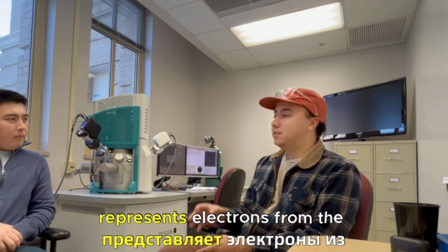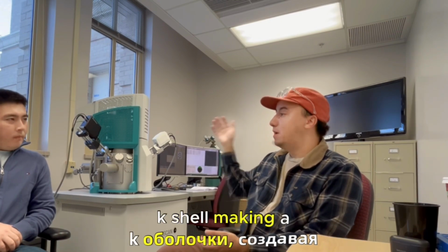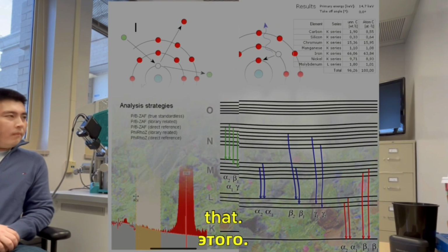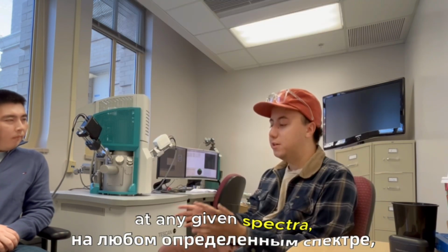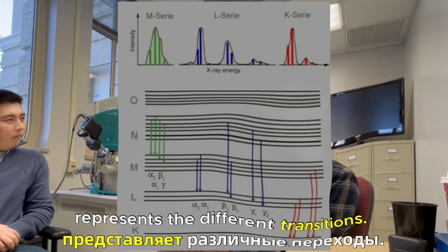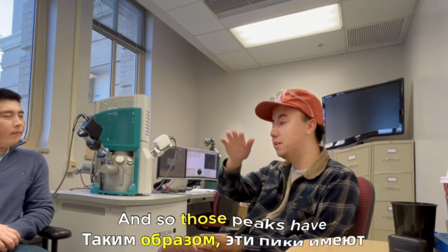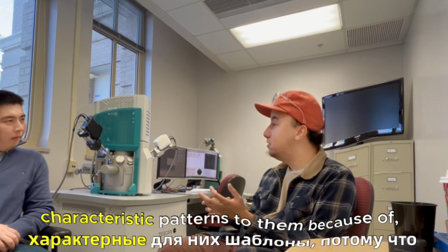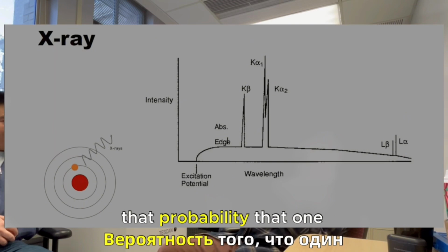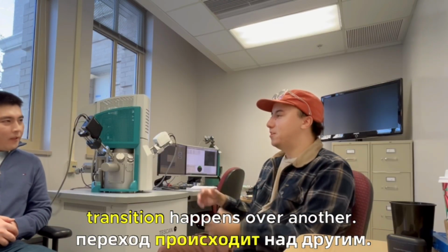And so that represents electrons from the K shell making a specific transition and releasing a specific energy. So when you look at any given spectra, you may have multiple different peaks for one element, and that just represents the different transitions. Those peaks have characteristic patterns to them because of, like I said, the probability that one transition happens over another.